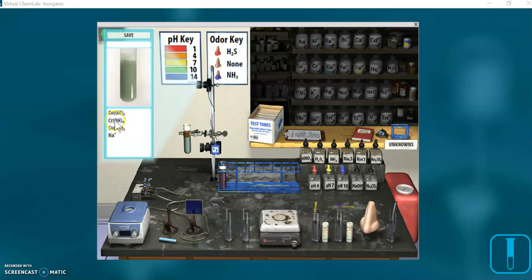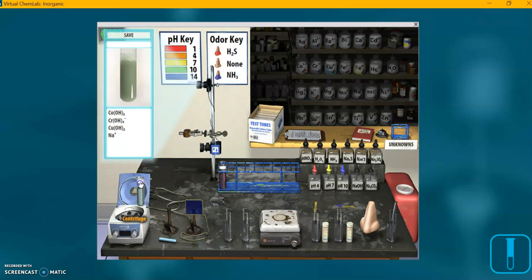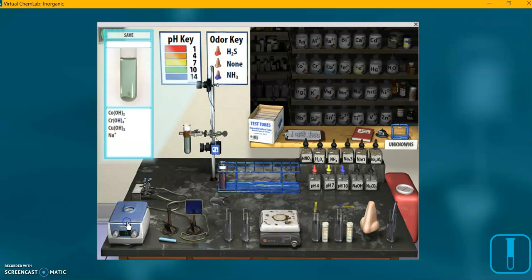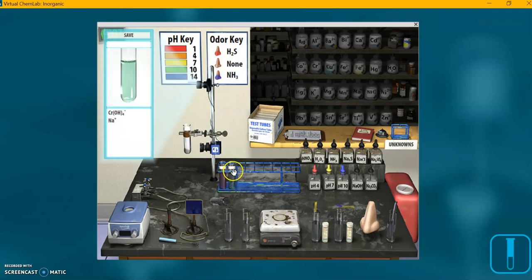We've started to separate our ions and we're going to continue that. I'm going to click centrifuge — you don't have to drag it over, just click it and it immediately spins. It spun the precipitate down to the bottom, leaving a nice clear soluble solution on top. I'm going to go over to Decant, and after a slight delay it puts the decanted solution here. Left in the other tube is the precipitate along with some water that is always added when you click the Decant function.